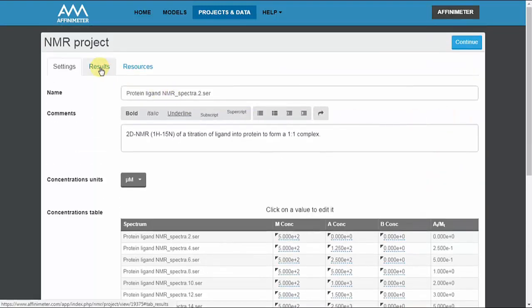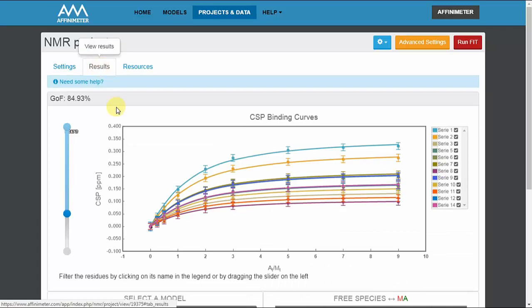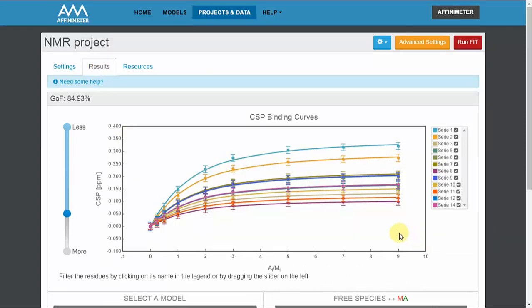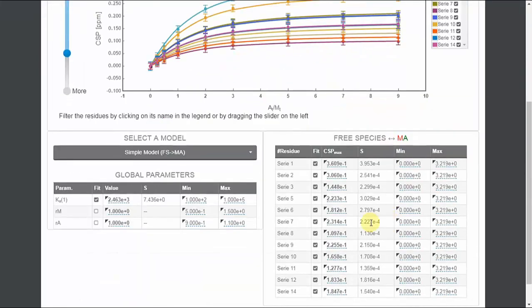One of the advanced tools of affinimeter is the possibility to perform a global analysis of binding curves for a more robust analysis where a single value of the binding constant is obtained.